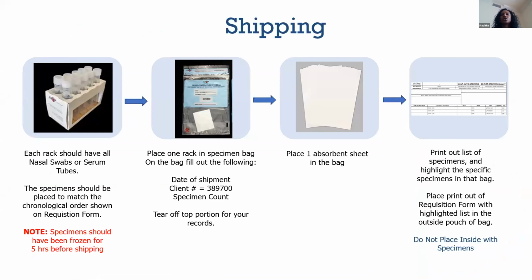Okay, so these are the instructions for shipping. I think some of your labs might be doing it, or if you have done shipping for biological substances, you kind of know these steps, but I will briefly go through them. You'll take your rack from the freezer.